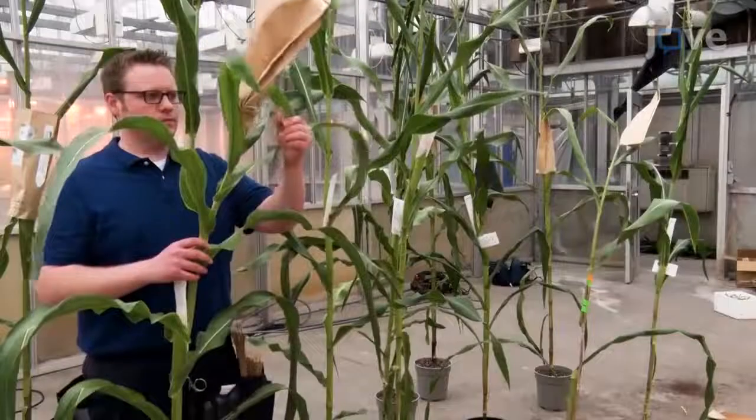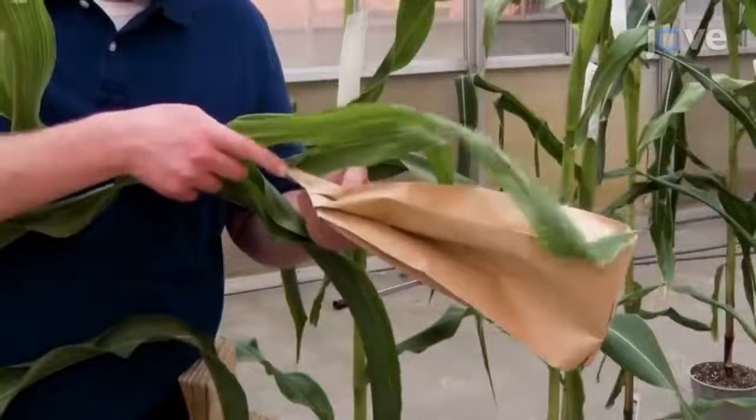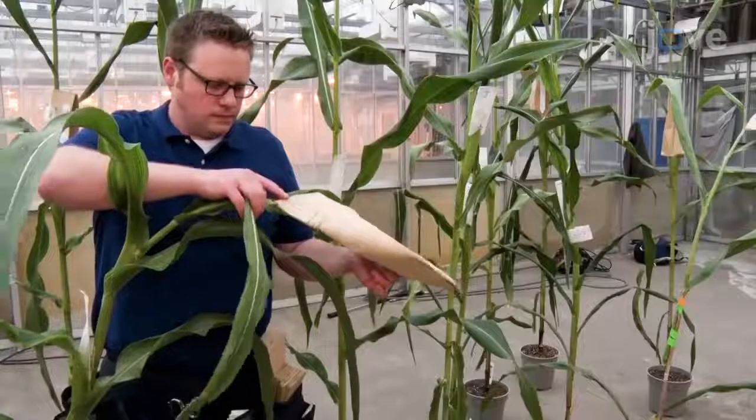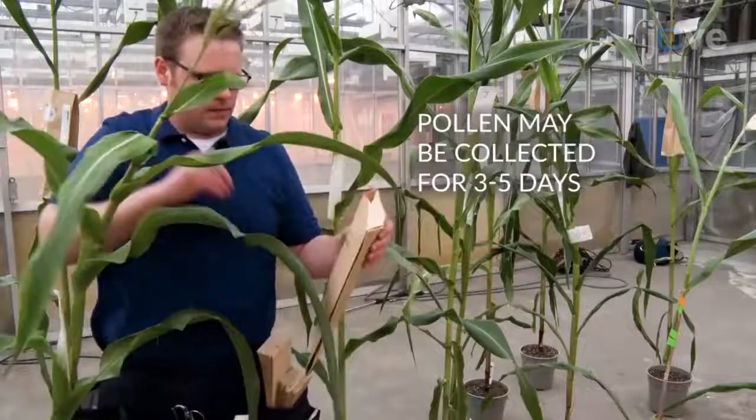The morning after placing the tassel bag, gently bend the plant and tap the bag to encourage pollen to be released. Then remove the tassel bag and fold the top of the bag over to prevent pollen from escaping.